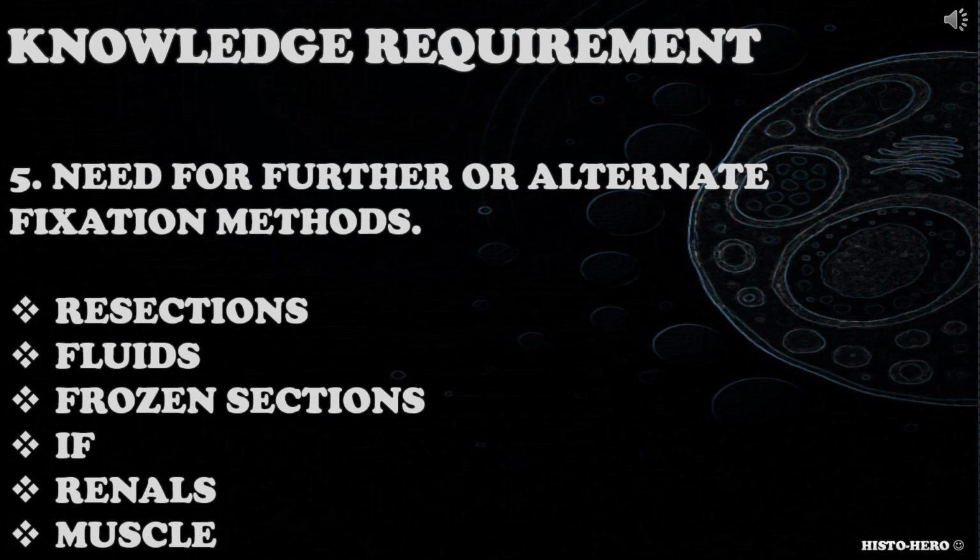When addressing this knowledge requirement, candidates should consider resections that need opening or inflation, delay to fix samples, non-gynae fluids and their fixation method, frozen sections, immunofluorescence samples, renals, muscle and so on.